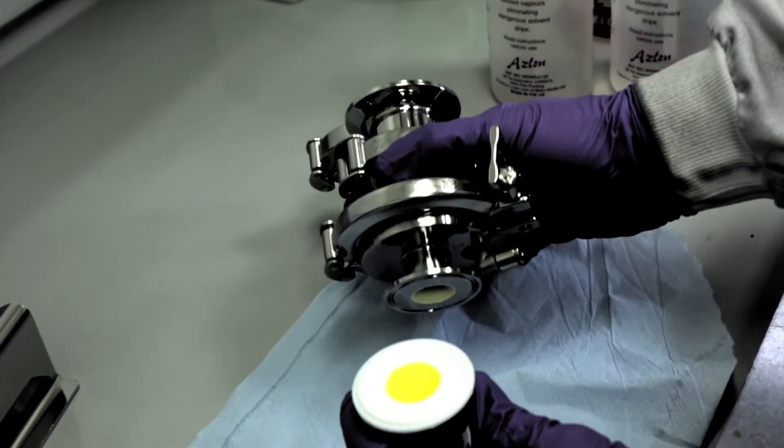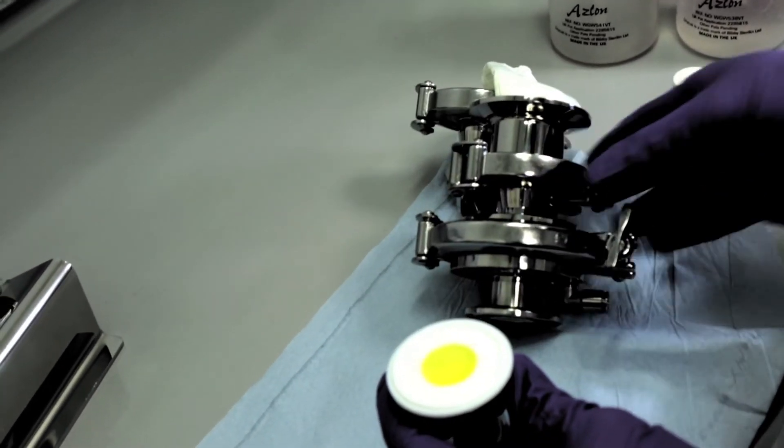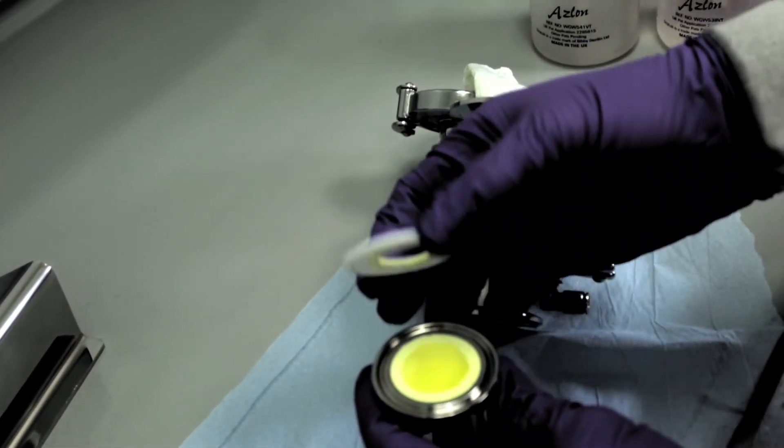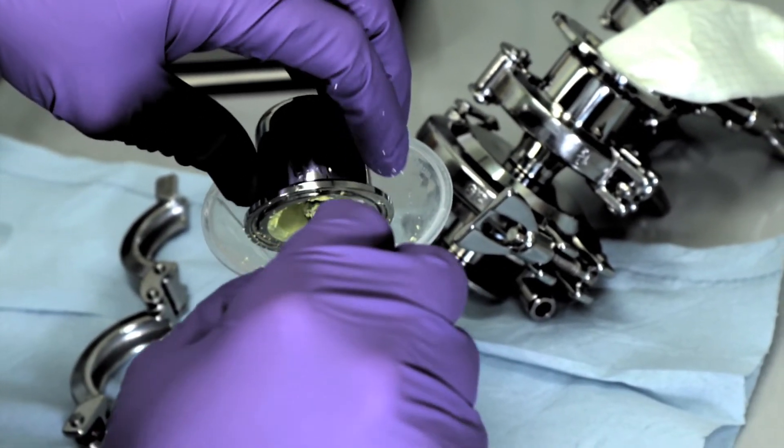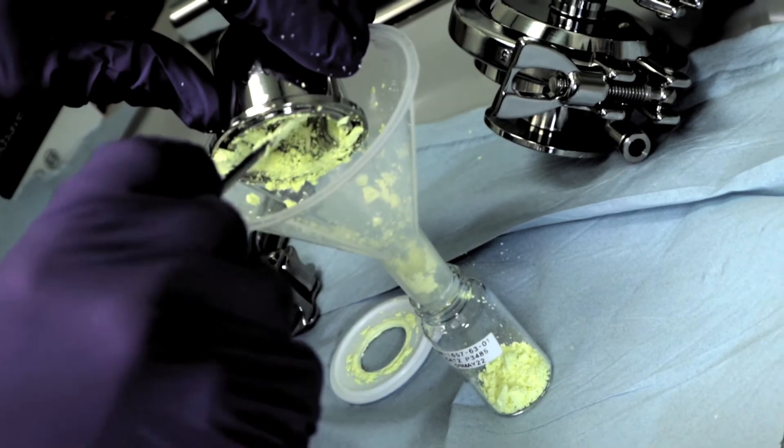If GMP material is needed for clinical work, we have jet milling capability on our production sites. Our mills are well characterised and with the help of modelling, procedures can be rapidly scaled up to kilogram quantities.